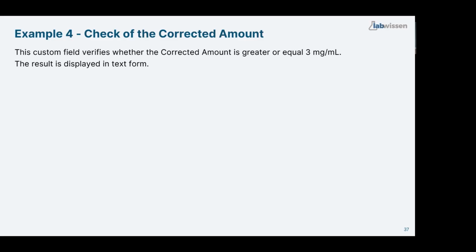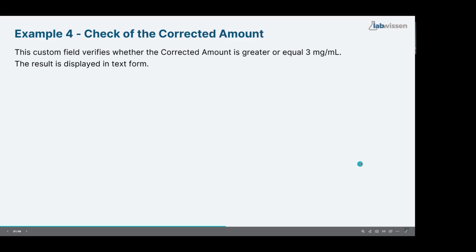So let's think, what is a field type and what is a data type here? Who wants to guess? You can put your answers in chat. Anyone else? Okay, I reveal it.